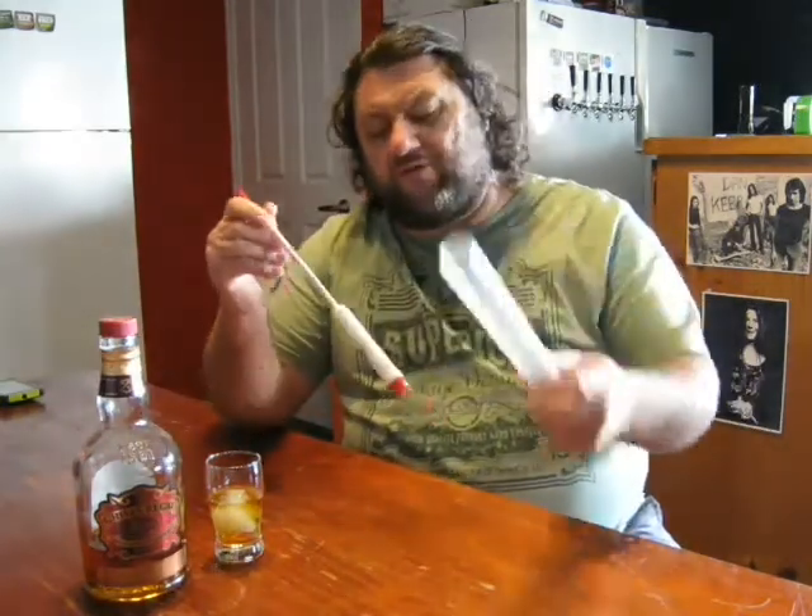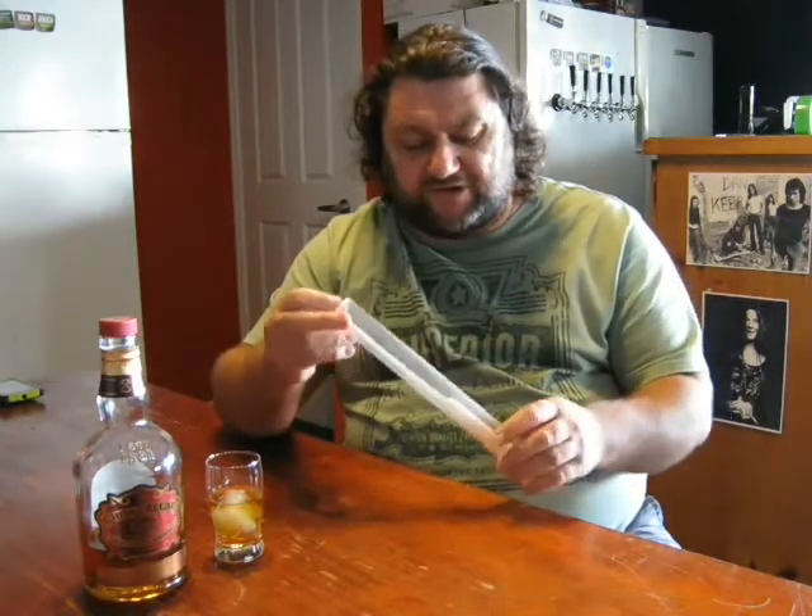Your hydrometer will come with a tube of some kind — normally when you buy one they come in a plastic tube which you can use to take your samples and measure it. Hydrometers work off water being at a certain temperature, it's normally about 20 degrees, and it will vary from hydrometer to hydrometer — it's normally marked on them, so it's either 15 or 20. There's realistically only one point difference between the two, so even if you're not sure which yours is, it's not going to make a hell of a lot of difference.